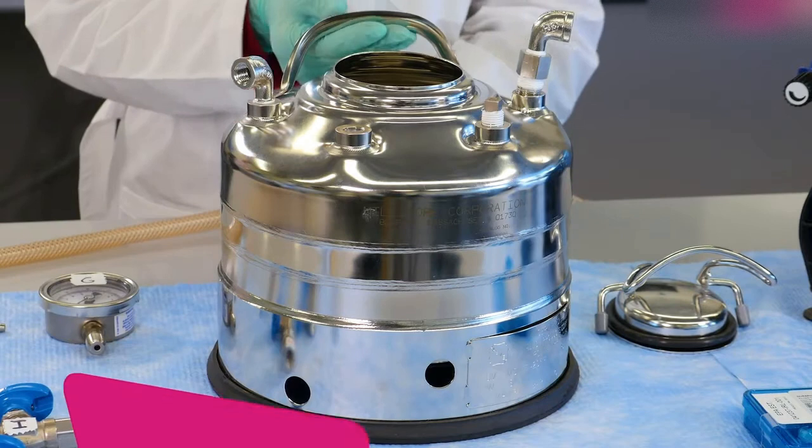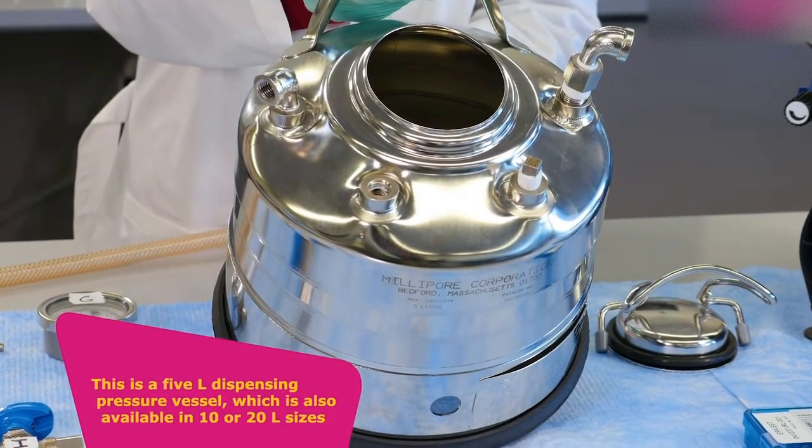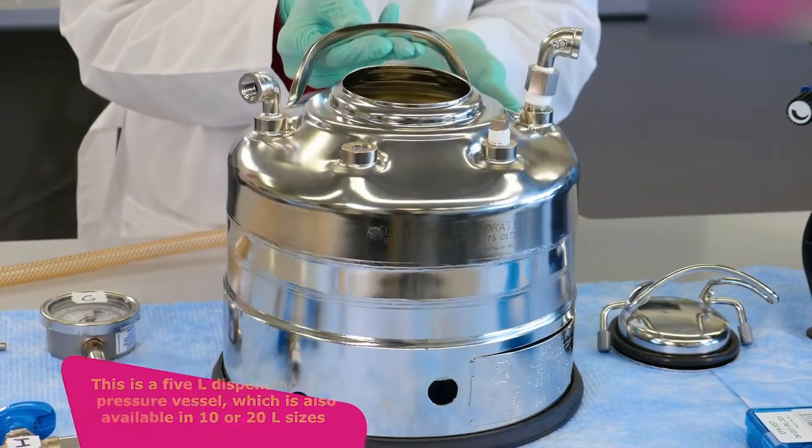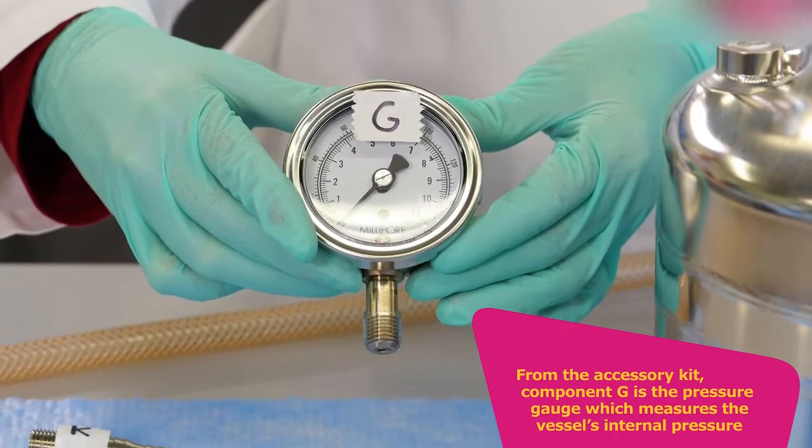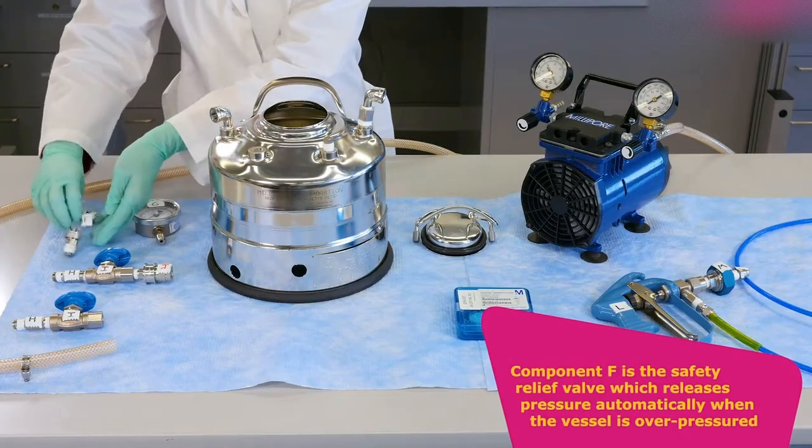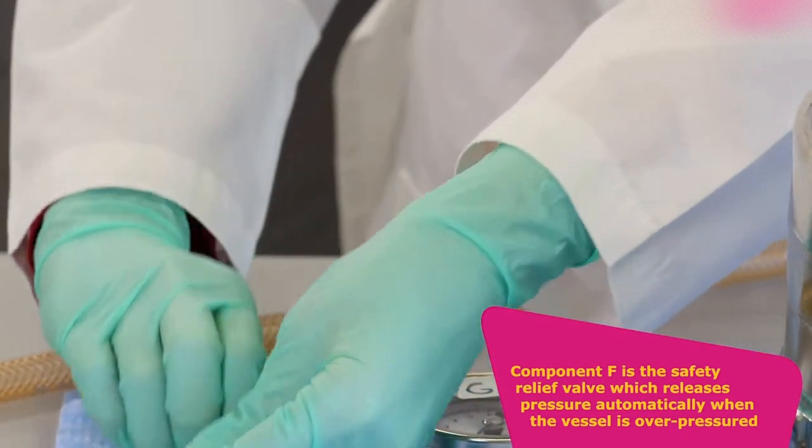This is a 5-liter dispensing pressure vessel, which is also available in 10 or 20 liter sizes. From the accessory kit, component G is the pressure gauge, which measures the vessel's internal pressure. Component F is the safety relief valve, which releases pressure automatically when the vessel is overpressured.